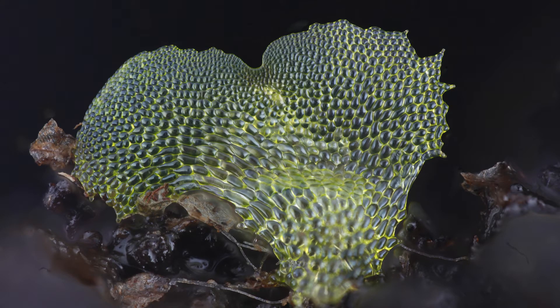This photograph shows a gametophyte fern that is only about 2mm wide. Up until recently, it would have been impossible to take a deep focus photograph at this magnification because the technology did not exist, but just recently that has changed. The photograph was taken with an ordinary digital SLR camera, a microscope objective and a little bit of DIY construction work. In making this video, we are hoping to show how this technology works so that other research labs and individuals can build the same kind of setup and start to share images of their own tiny photographic specimens.